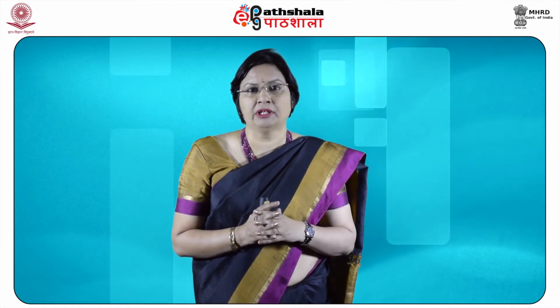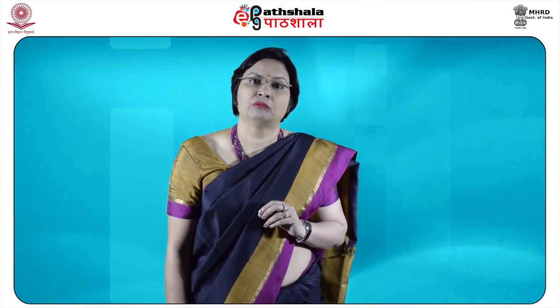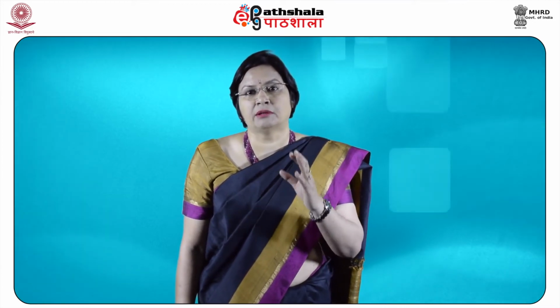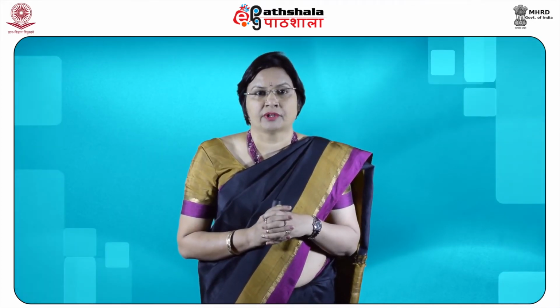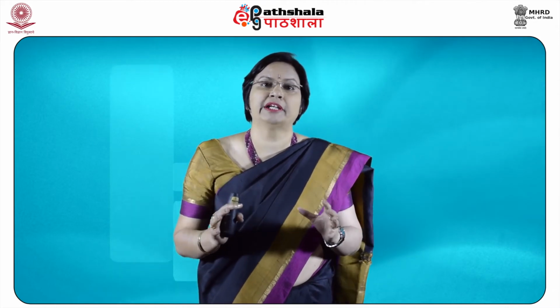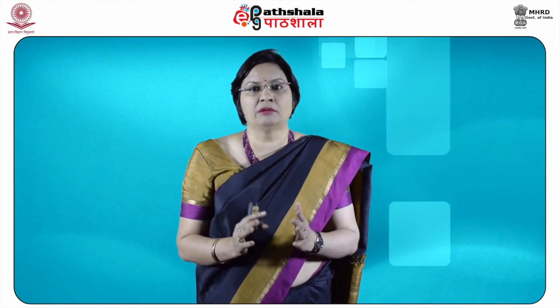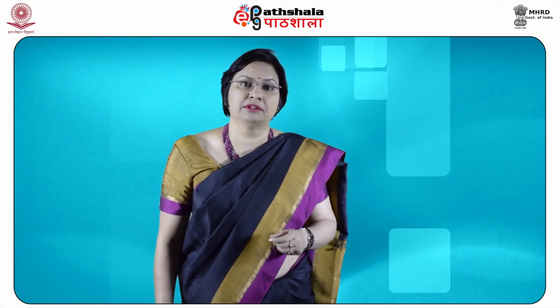Talking about the IR spectroscopy, the IR values from the IR spectral data will give you information regarding what functional group must be present in that particular molecule, based on obviously the reference values which we will study. The 1H NMR will tell us about the number and the environment of neighboring hydrogen atoms which are present. The 13C NMR will help you in getting the information about the type of different carbon atoms which are present in the molecule. And the mass spectral data will give you information about the total mass and fragmentation pattern of the molecule. And by combining all this information, we can easily find the structure of the molecule, whether it is simple or it is complex.